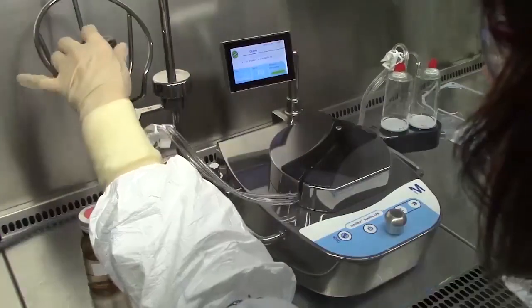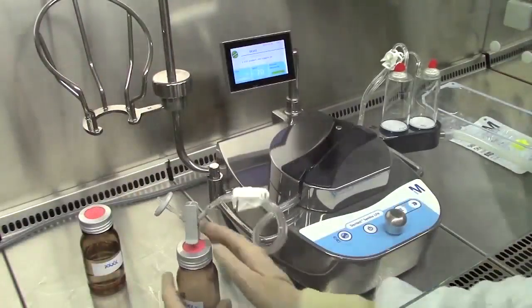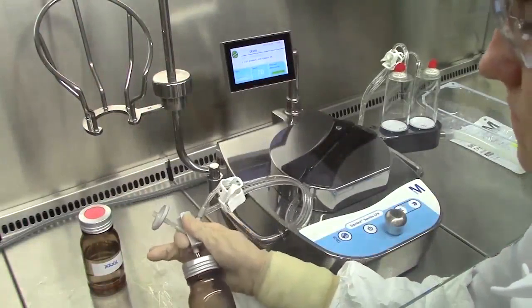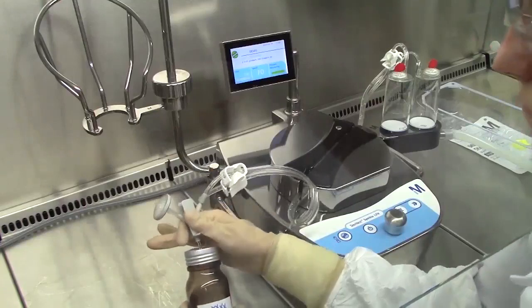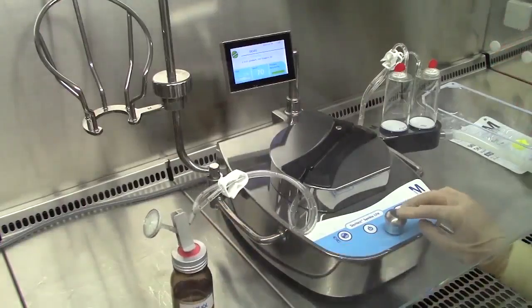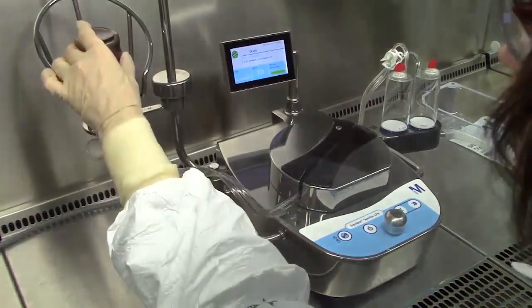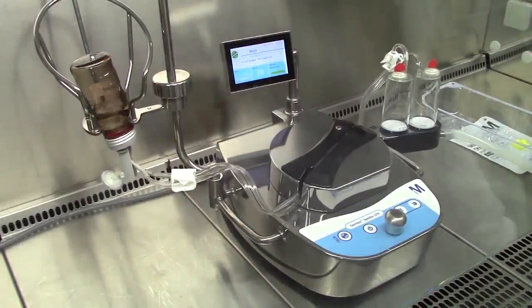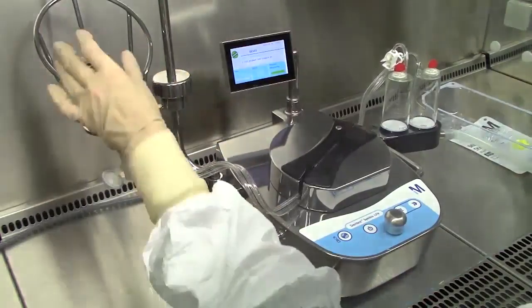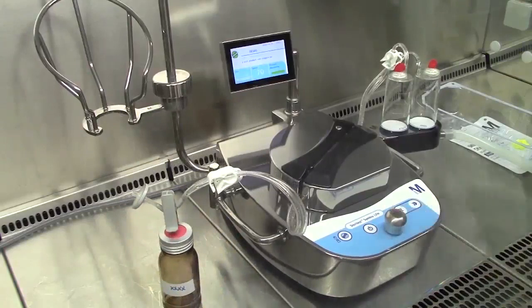When the sample bottle is empty, remove it from the bottle holder, stop the pump and install the second sample bottle. Start the pump and let it filter until the bottle is empty. Repeat the above steps until the required number of product samples has been processed. Stop the pump.